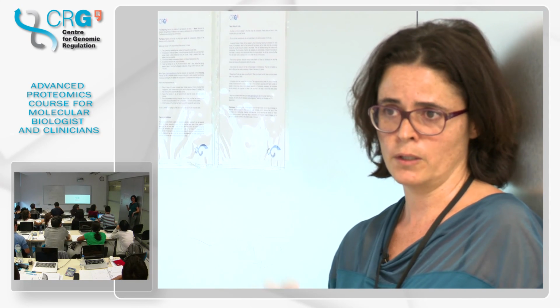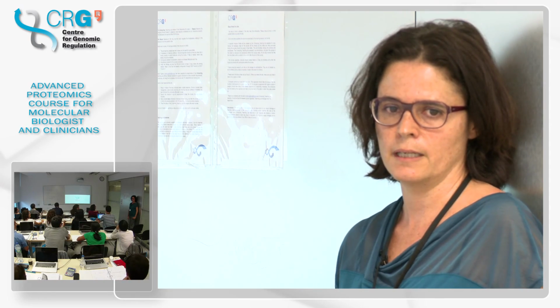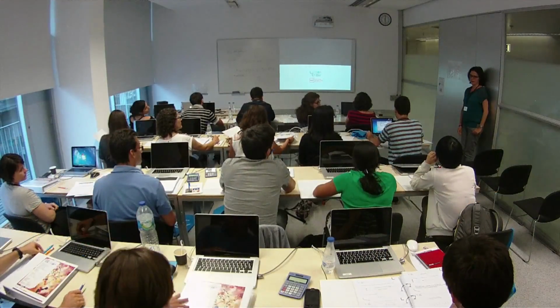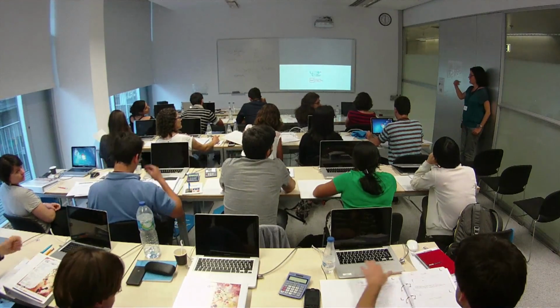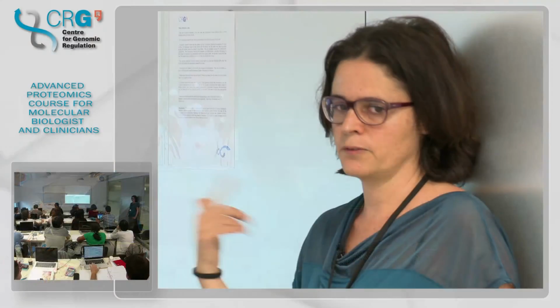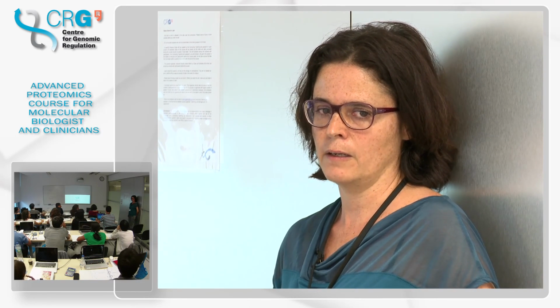So we know exactly the amount that we are using, and we can control very well the response we should have. So it's like an everyday schedule? Every day, yeah. And after each run in the MS, we always run a short BSA sample just to check that the instrument is working. Yeah, we care a lot about quality control.